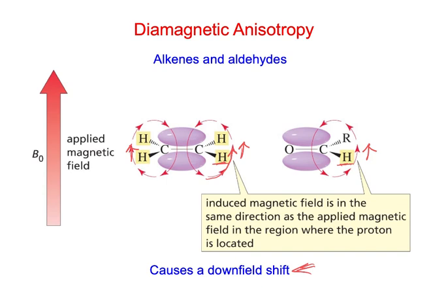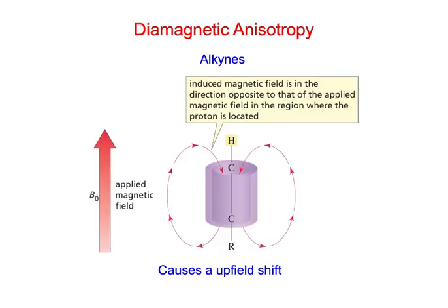Is it correct to say whenever we have sp2 or sp, we have anisotropy? Yeah, I think so. With the sp system, because it doesn't really follow the same trend, it's a little bit of a different situation, a different orientation, because for an alkyne, we have two pi orbitals that are perpendicular to one another, right?